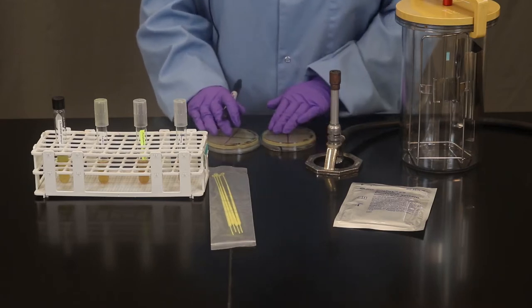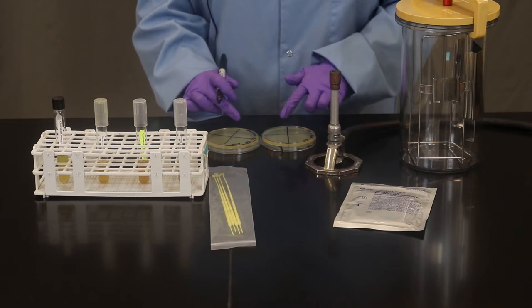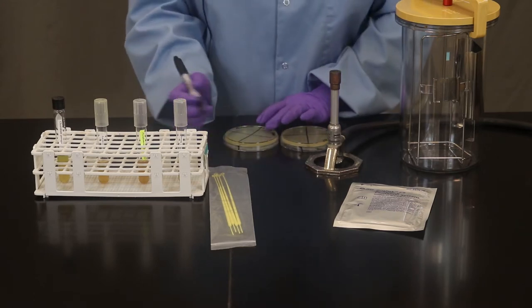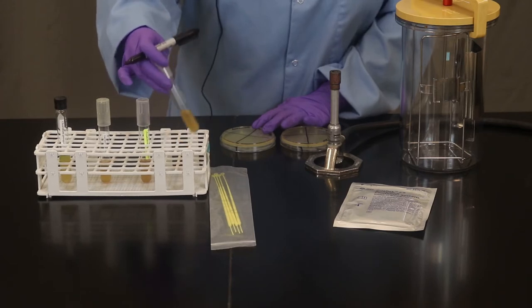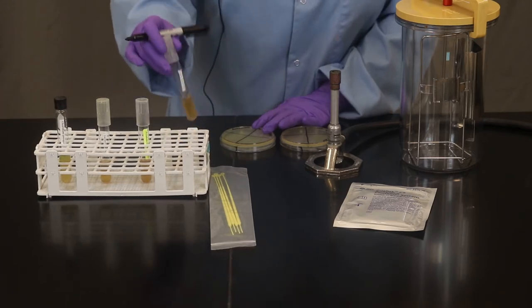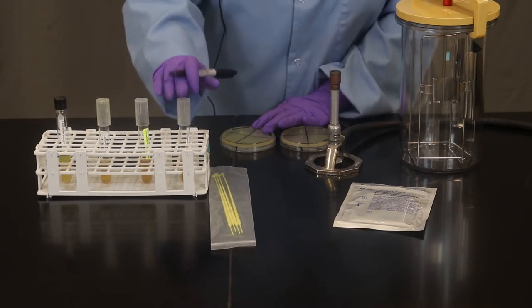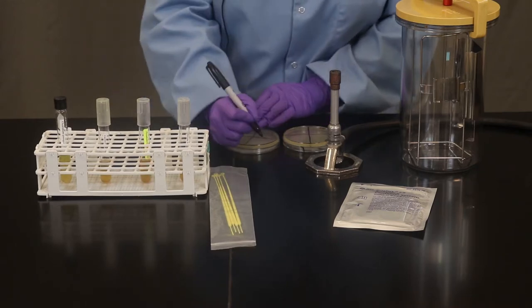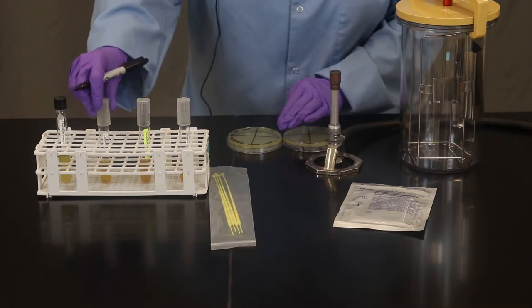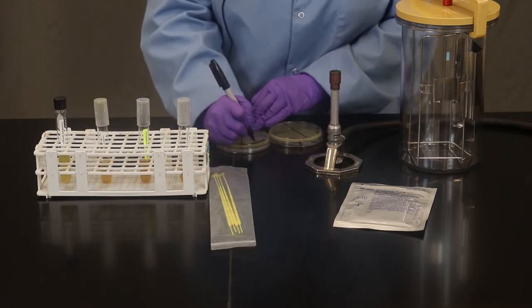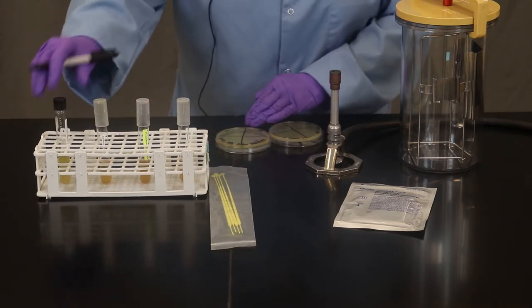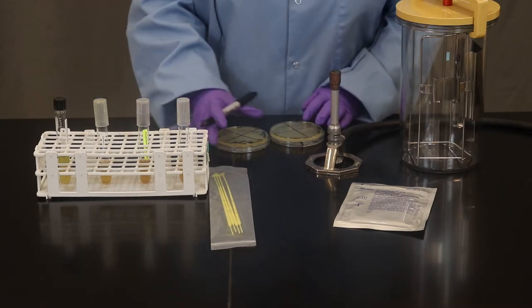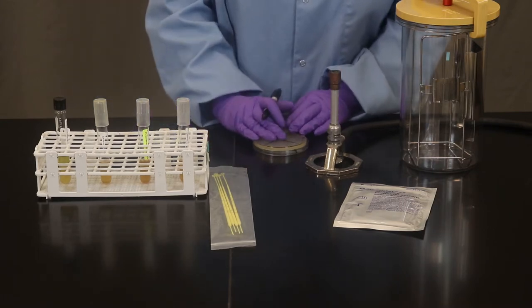In addition we're going to label each quadrant. One quadrant is going to represent each bacterium. Now instead of writing out the whole name Serratia liquefaciens I'm just going to write the initial. So I'm going to write SL, PA, LL, and CS. You can review the names in the lab manual again later. I'm going to repeat that for our other plate here.